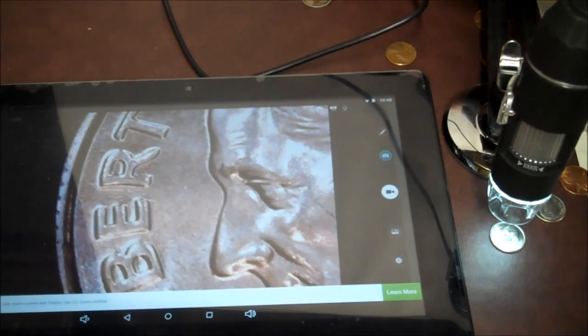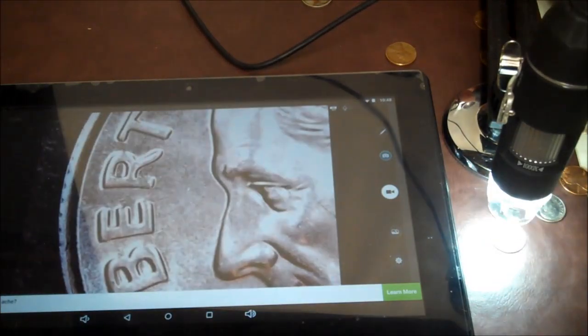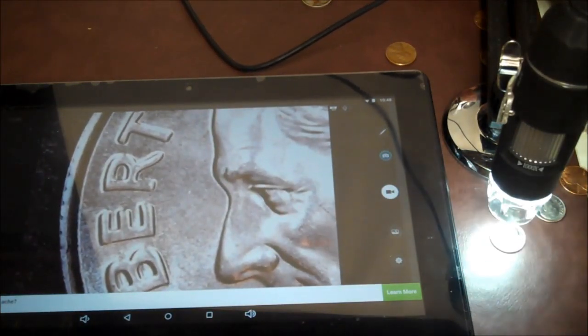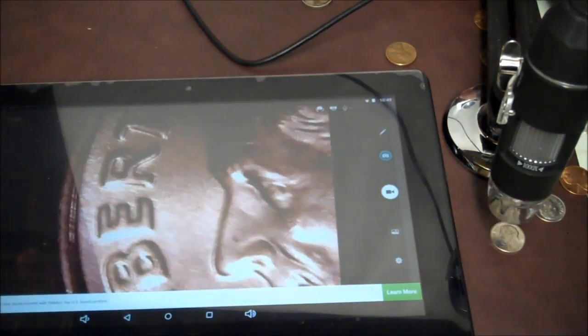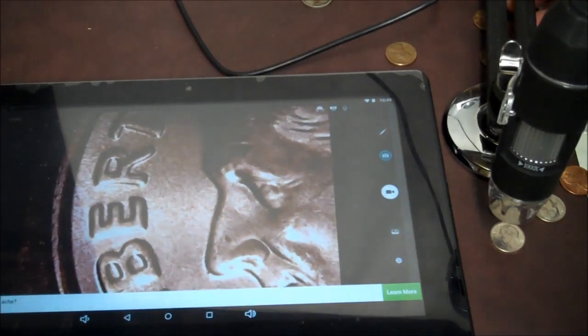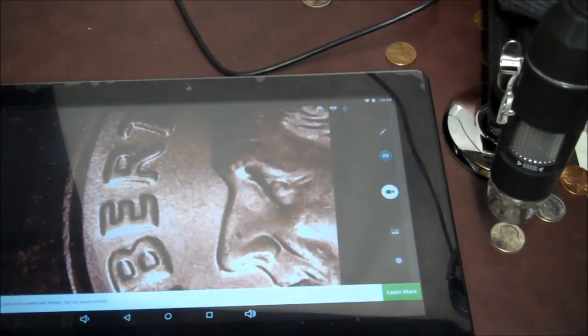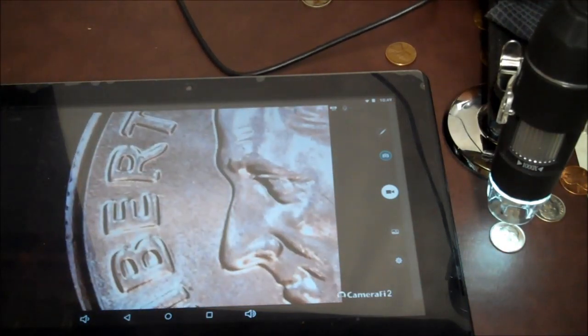So then you can turn the light up or down on this. Like this. See how bright it gets. The brightness doesn't seem to matter much. But when you turn it off, you can see the difference. Now we're just doing all room light. So sometimes I think the light is casting a bad shadow. See?